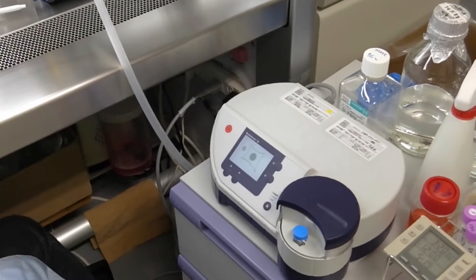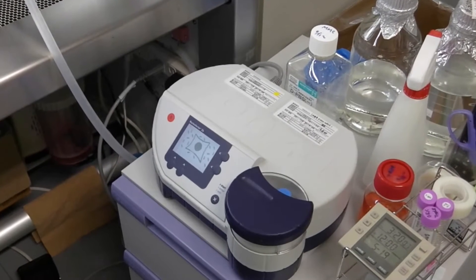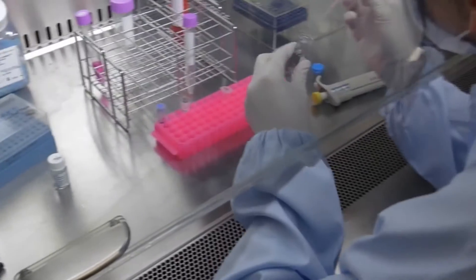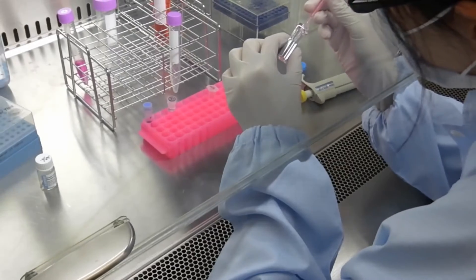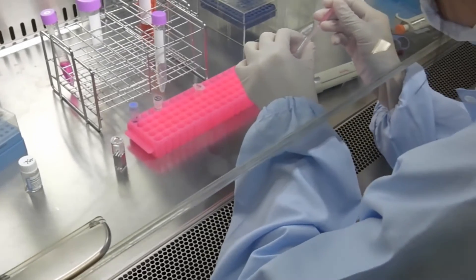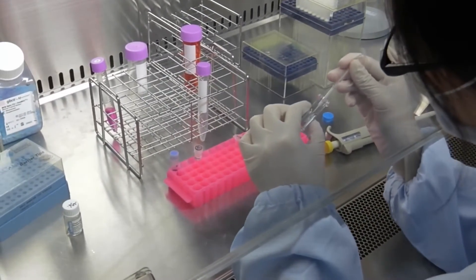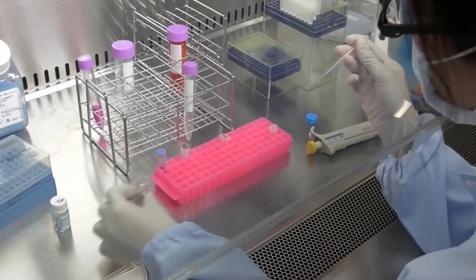The cuvette is inserted into an electroporator and transfection is carried out. After electroporation, the cell suspension is immediately transferred to a microtube containing 0.8 milliliters of mononuclear cell culture medium and mixed gently.